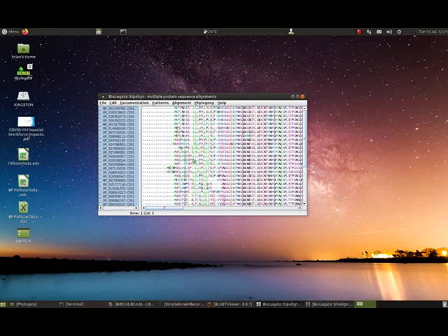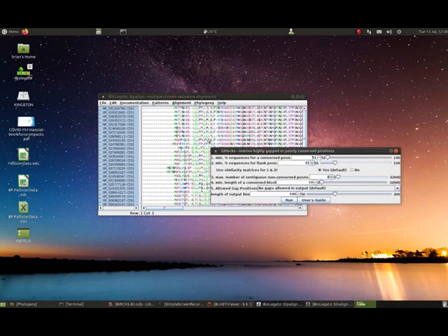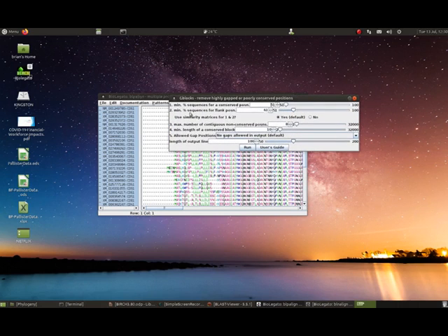Fortunately, there's a program called Gblocks that does a very good job of editing out the most gappy regions. So I've selected all of the sequences, and I'm going to run Gblocks, and by default it will require that a conserved position be present in at least 51% of the sequences, and then for the flanking positions, what percent of the sequences have to be in a region flanking a gap. So I tend to set it so that only positions with less than or equal to 50% gaps are included in the output.